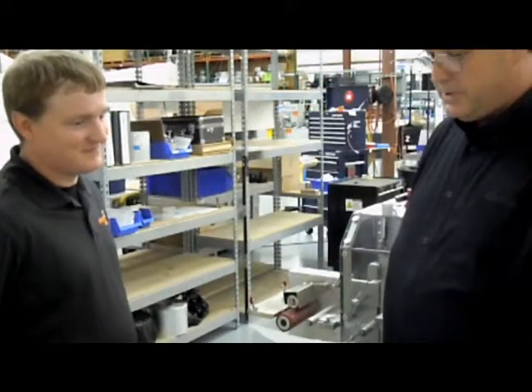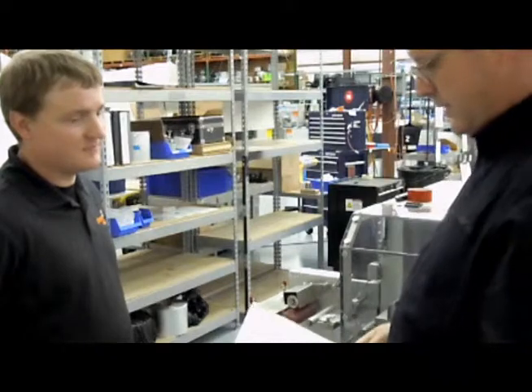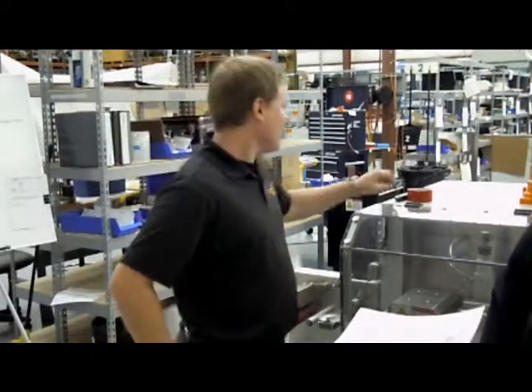We're at PharmaWorks with Dave McTavich, looking at the Monta 257 tape and how it's used. Dave, if you could just walk me through the importance of using the right tape and how to splice it, we'd appreciate that.